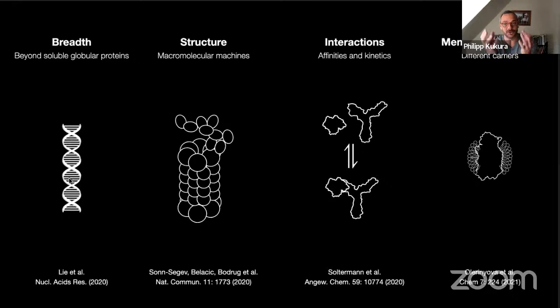And that's very different to a globular protein. With a globular protein, you can convince yourself that the majority of the amino acids are a little bit like in bulk. But here you're really starting to get into problems. You have a molecular wire. What's the polarizability there? Then look at structure, just from the perspective of, do I have something that is assembled, or do I not? Because if these bits are missing, I have a different mass than if they are there.